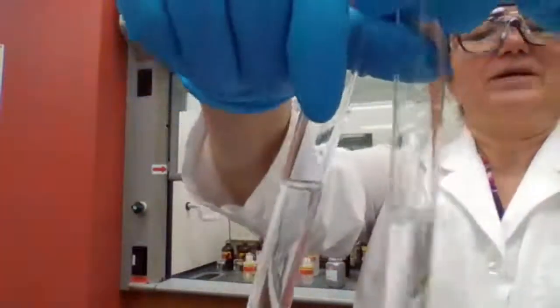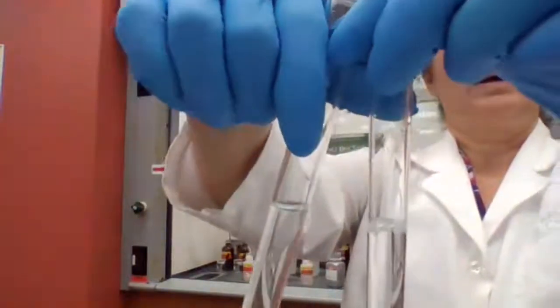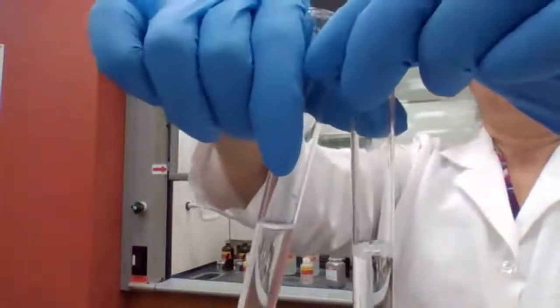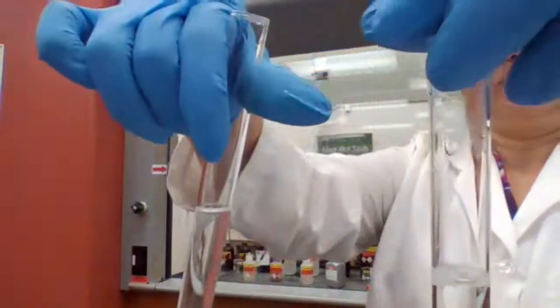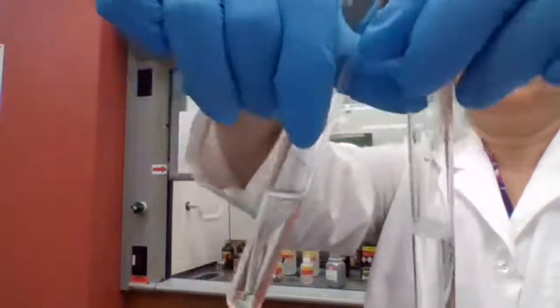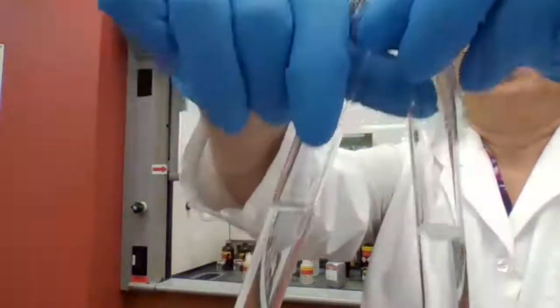Water, sodium hydroxide. You see the difference? And you can take a screenshot of this. Solubility of carboxylic acid, benzoic acid specifically, in water and in sodium hydroxide.